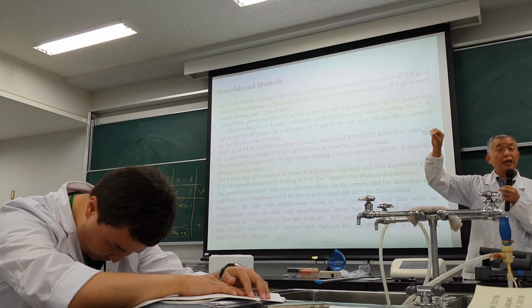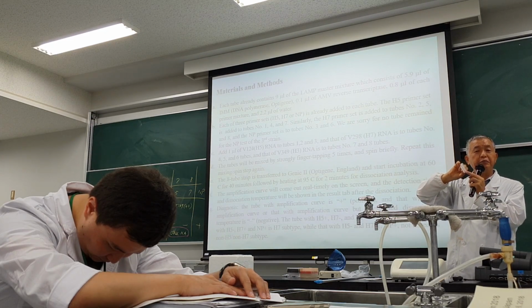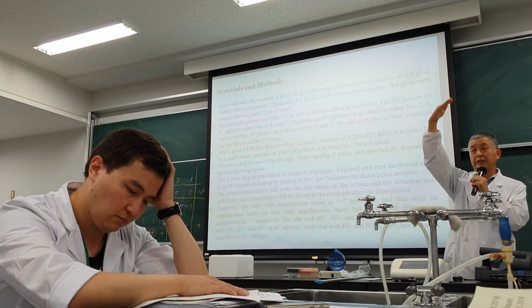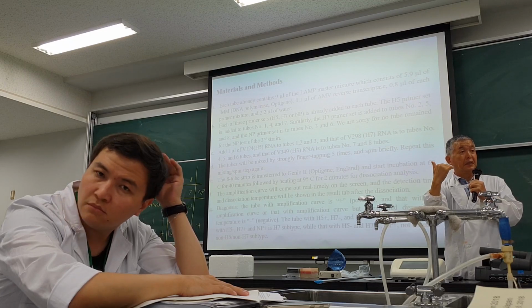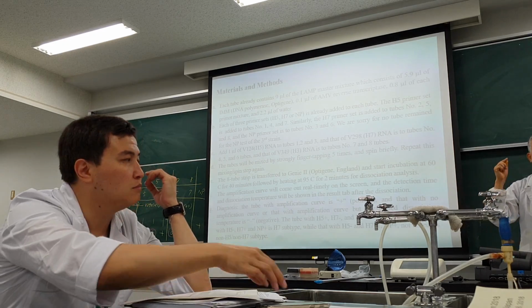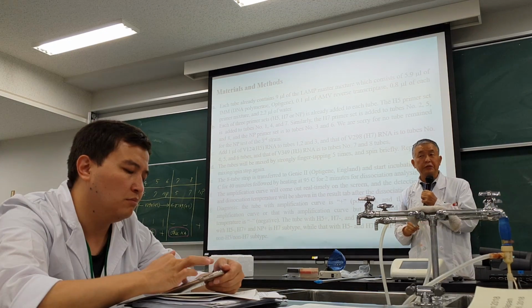This is a normal tube for PCR, but it has a lock system. When we push tightly, it is locked. The cap is locked and cannot be opened again after the reaction, because the most problematic issue with LAMP is the frequent occurrence of contamination.